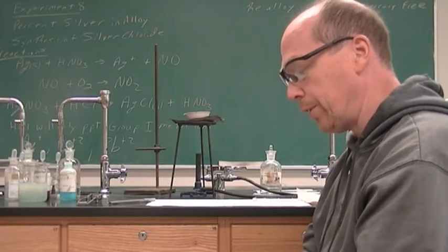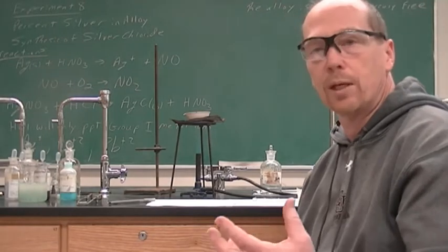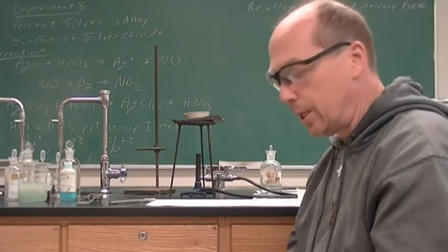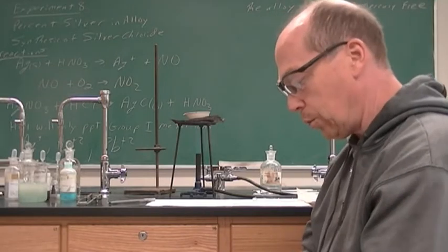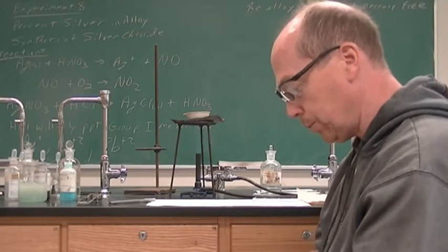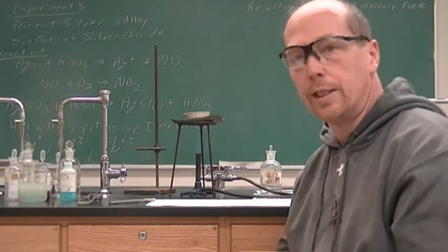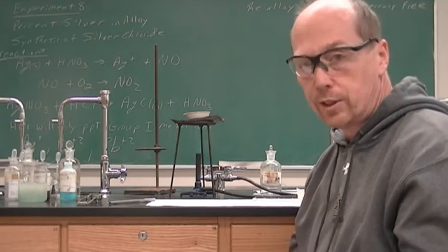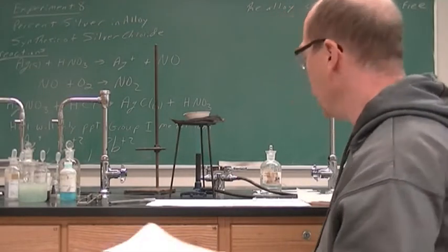The copper with the NH3, we knew that that did something because we knew the zinc did something as well. You could see the precipitates forming, and these are complex ions that were forming. Your copper complex ion was a much darker blue. Again, that is not something that you would need to know how to do. The silver nitrate with HCl forming silver chloride, that is something that you would need to know.